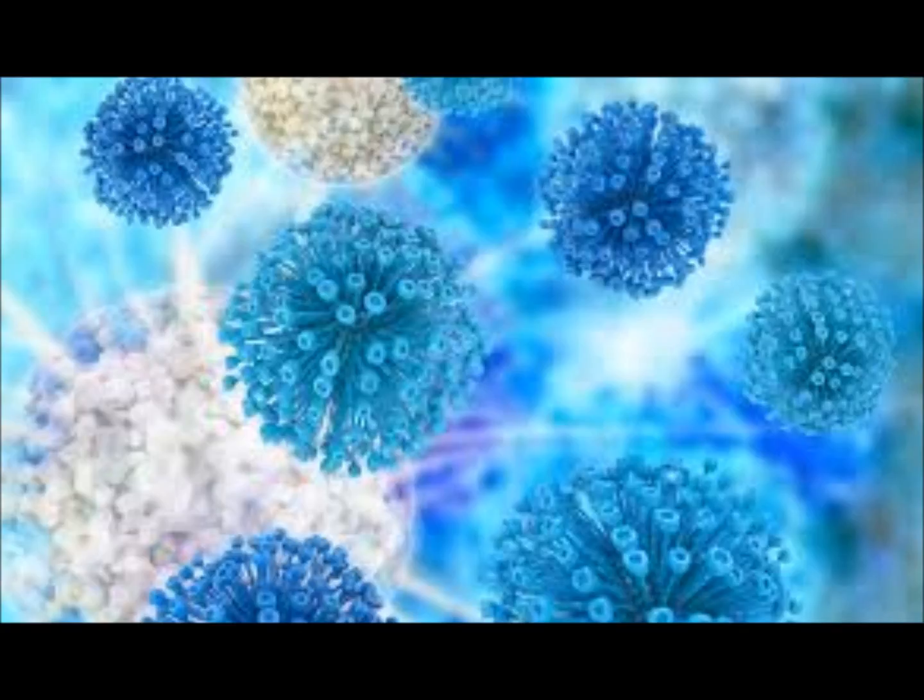And I think this is the toughest part. You gotta find it on 100. Okay, this is my white cell with the lobes. Then you gotta put that in the center and go back to 10 and try to count all of them on that little low power. Laura and I were talking the other day. I wish they would have come up with a number for the whites and the epis that you would see on 100 on oil, because you can tell them there. It's really tough to see some cells, and some of the specimens, the cells deteriorate.